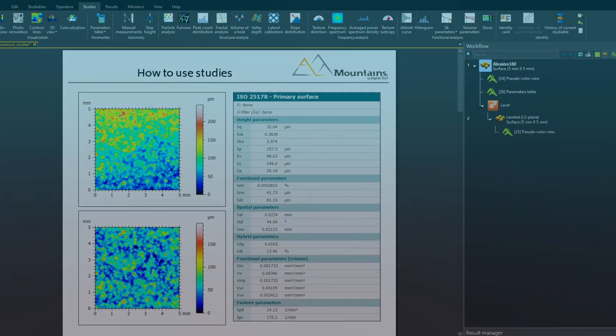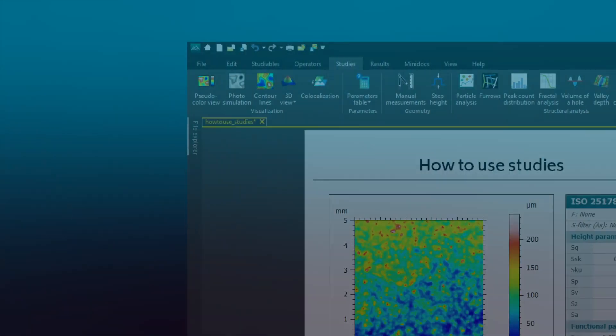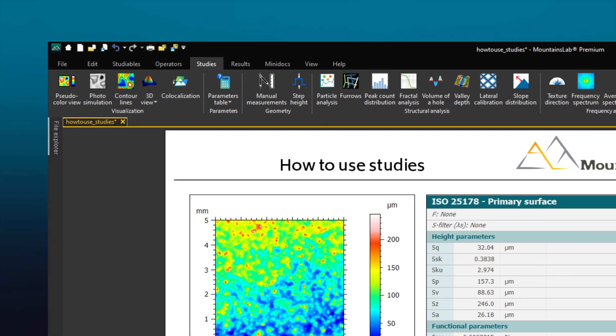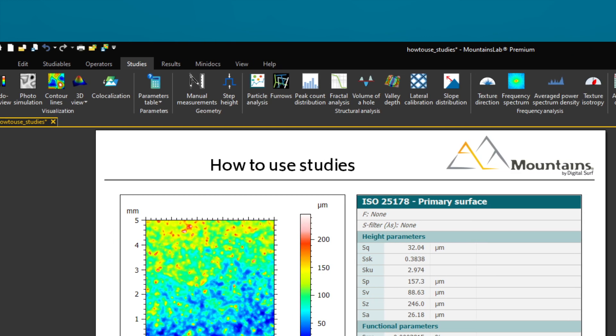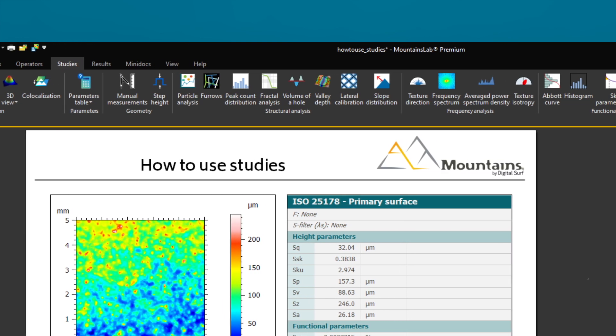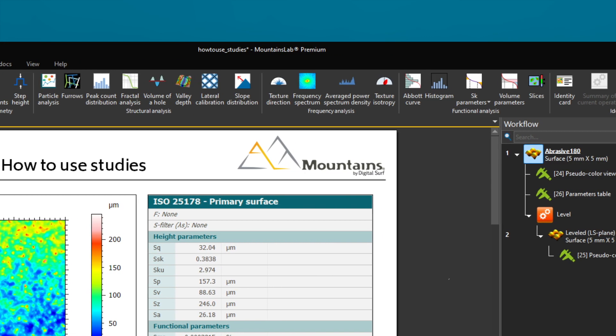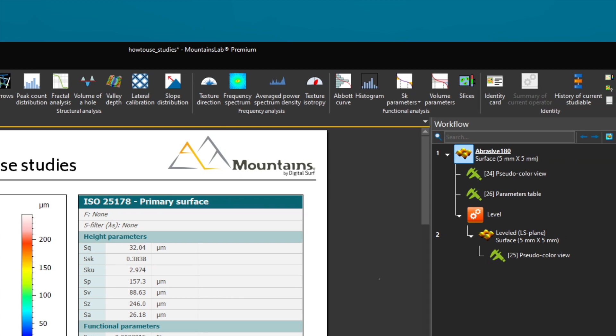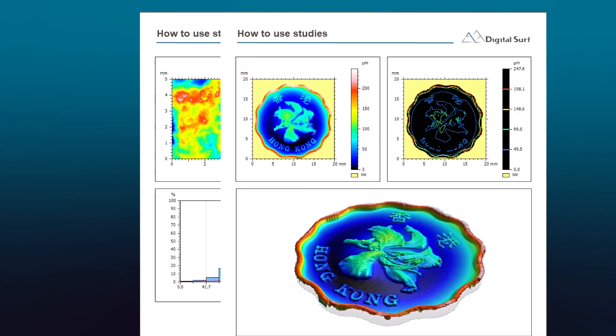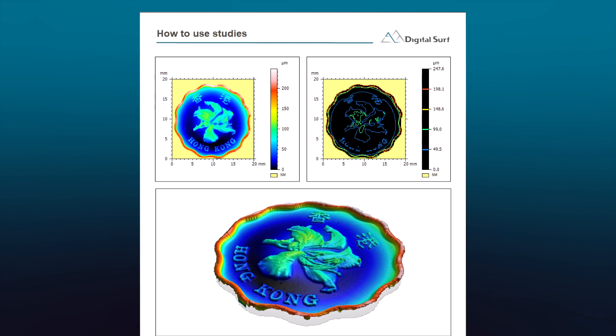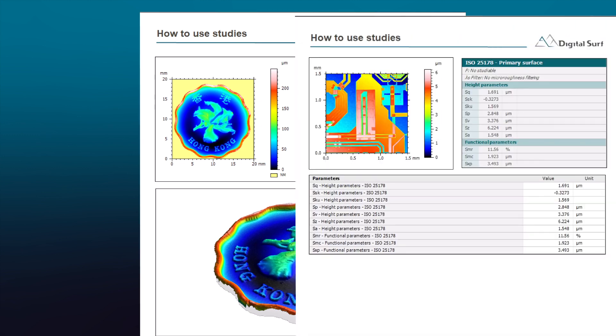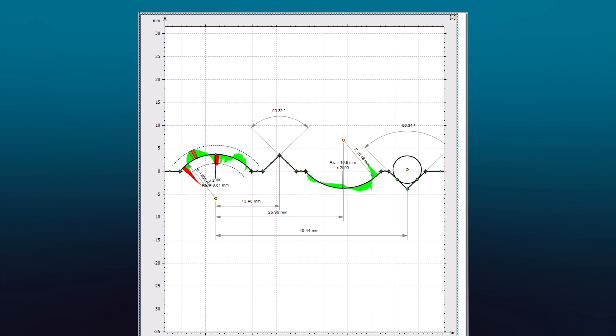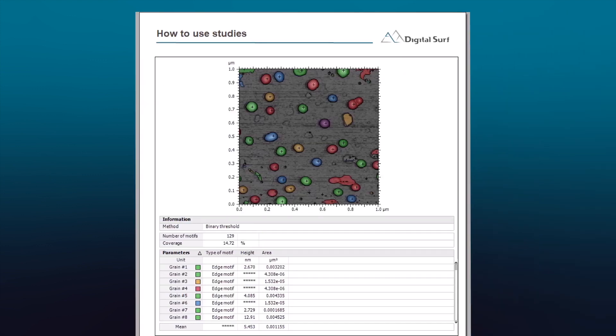In MOUNTAINS, studies are different types of analysis performed on data and which are displayed in the document. These can be graphical representations, visualizations, or analysis routines, such as the calculation of parameters, geometrical analysis, or structural analysis.